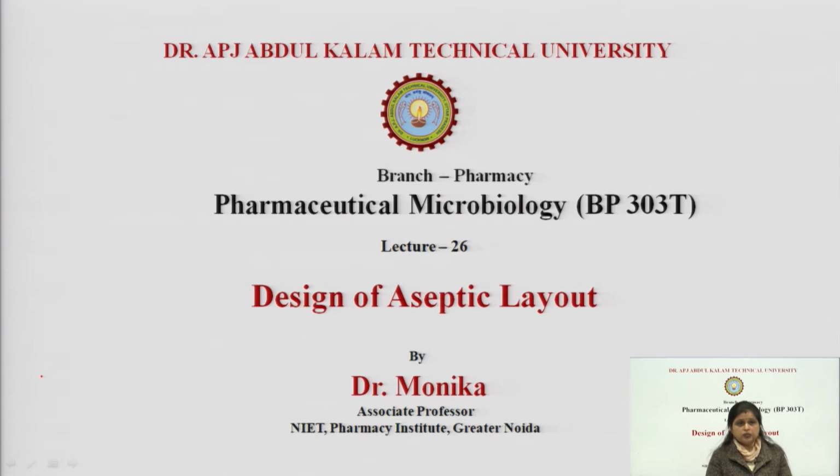The first module is aseptic techniques. How we follow aseptic techniques, what layout we can design, how we can design our microbial lab, and how we can design an aseptic room within the industries. You need to study the design of aseptic layout, the various sources of contamination within any laboratory or area, the main sources of microbial contamination within the environment, and also the clean area classification. This is module 1.